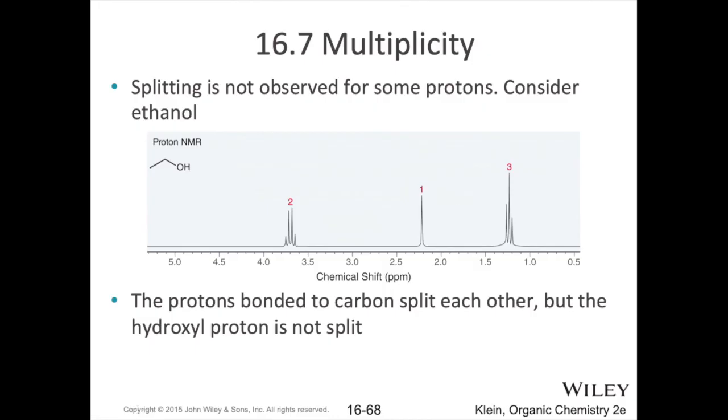So here's an example of a situation where we don't see coupling. I think earlier I alluded to the fact that alcohol protons are a little bit weird, and you can see in the scenario here that the hydrogen on our alcohol group does not split.